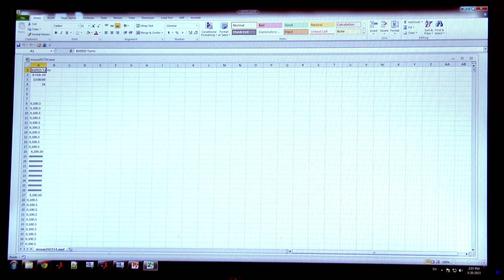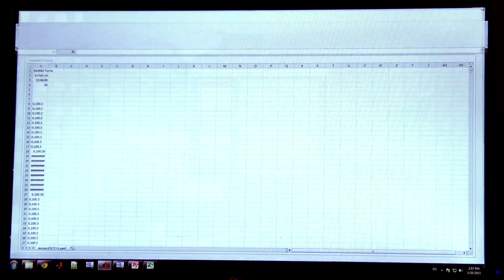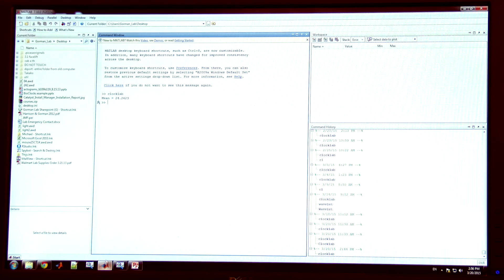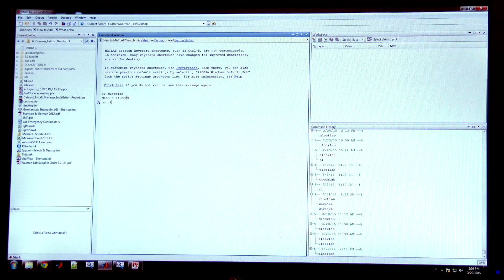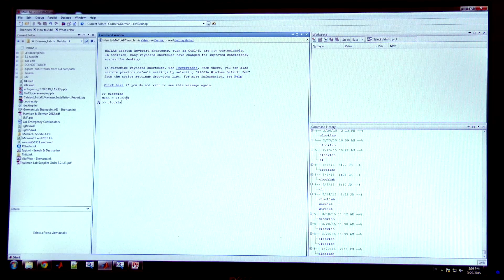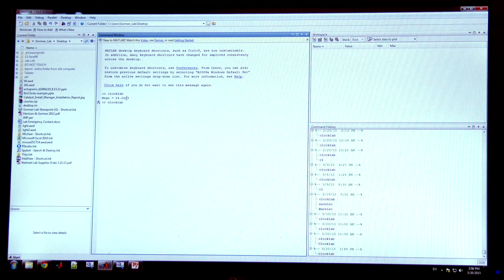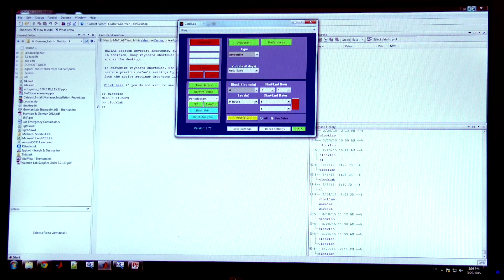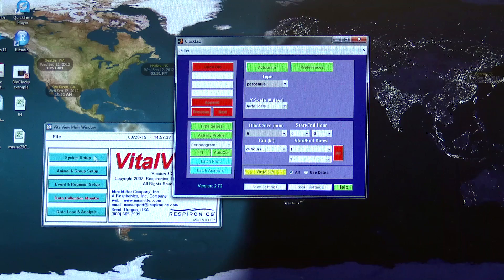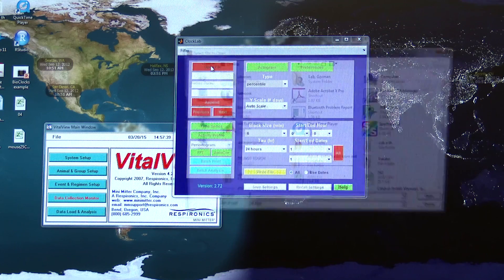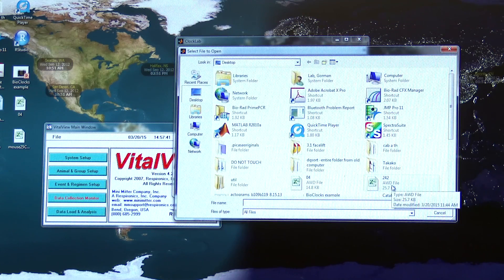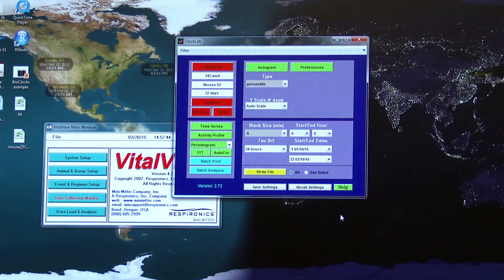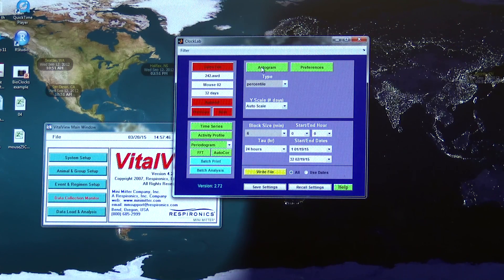In order to open ClockLab I'm going to use MATLAB. Once I open MATLAB I'll just type in ClockLab and hit enter, and this opens the ClockLab interface. Now I'm going to open that AWD file I just saved and then hit actogram.